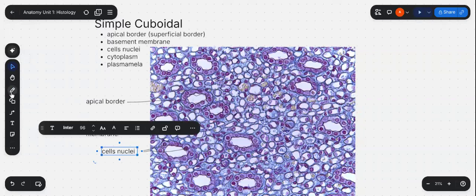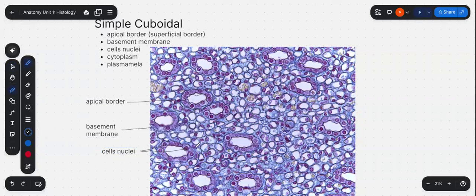Again, same thing. It is the space that is around it. So just all of that space, this space over here, cytoplasm. I'm not going to write it down again because I've already highlighted it, but you can see the spelling over here in the checklist. But that is your cytoplasm.